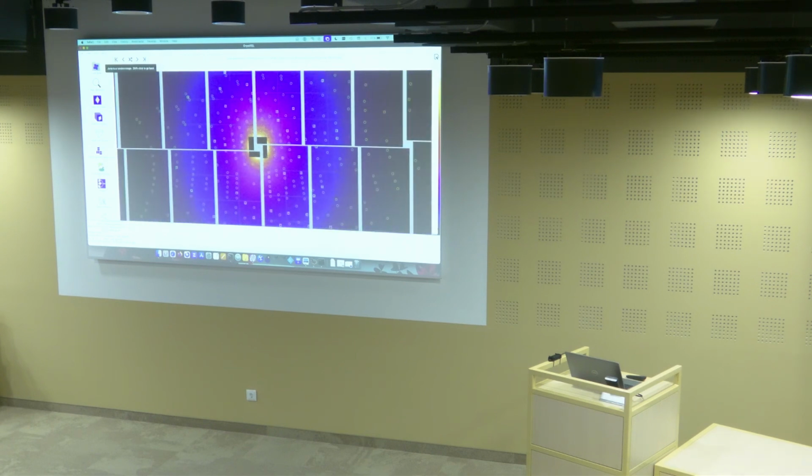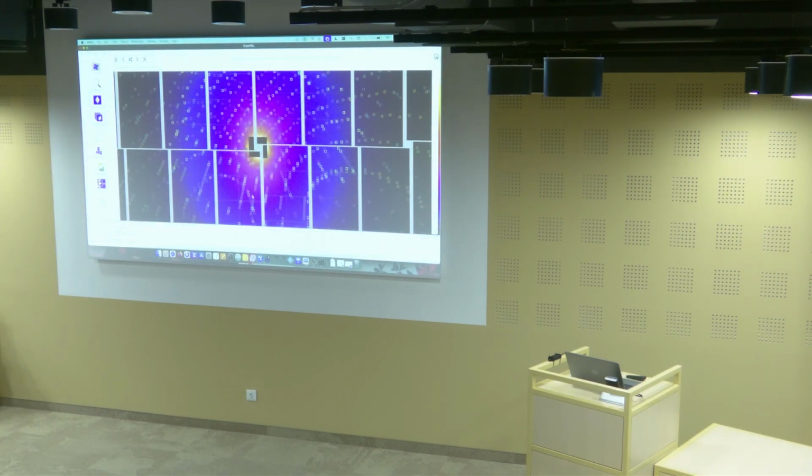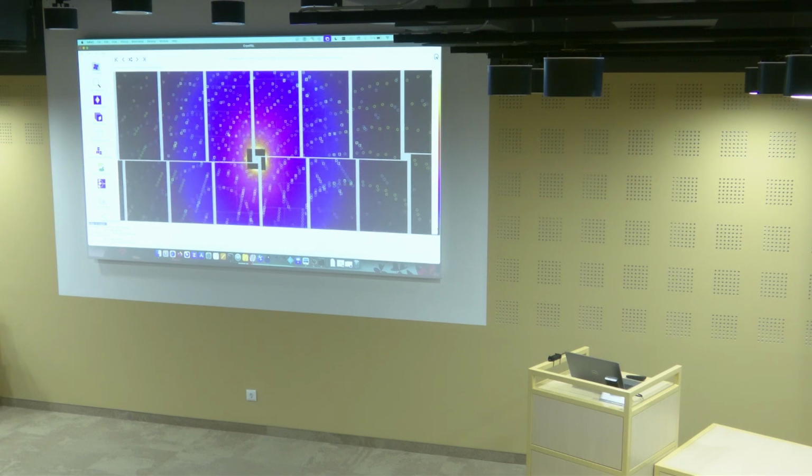We can also do that on another image to see, maybe something with some more peaks like this, where we have these very nicely separated lines. We try this again. We index this frame. So that works as well, but in this case it looks a bit chaotic because it found 2 crystals. So sometimes it can be a bit difficult to see from these kinds of things whether this is a proper indexing solution or not. And actually, it's very difficult if we have multiple crystals.